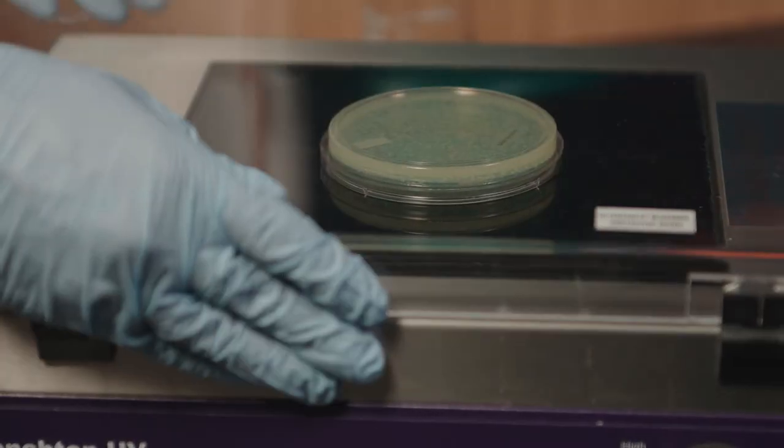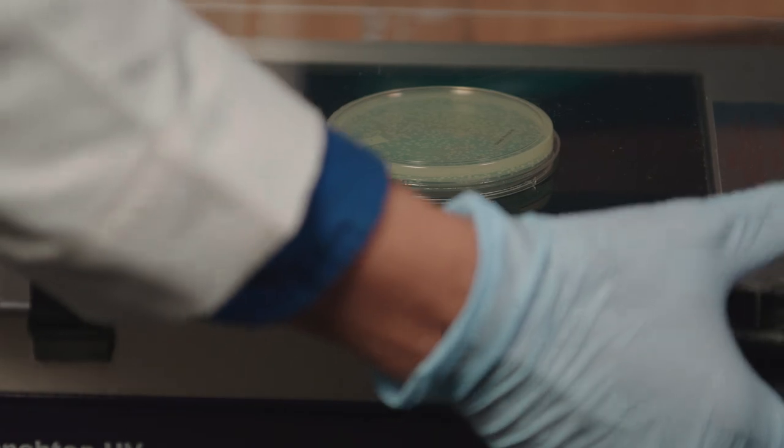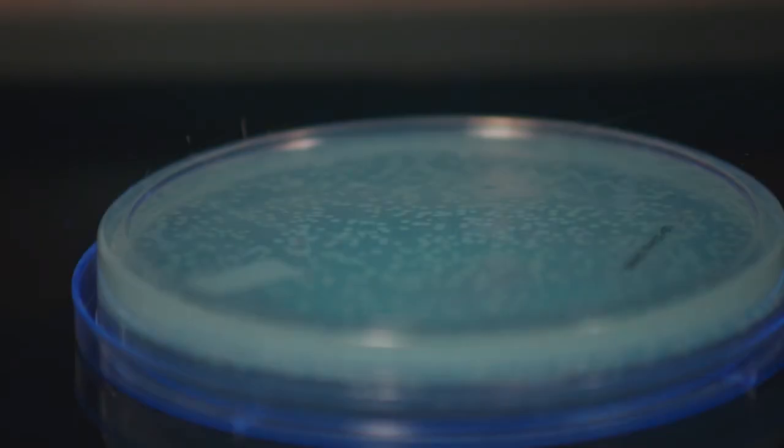Finally, retrieve the petri dish and place it onto the UV transilluminator. Turn on the UV light and observe the glowing colonies.